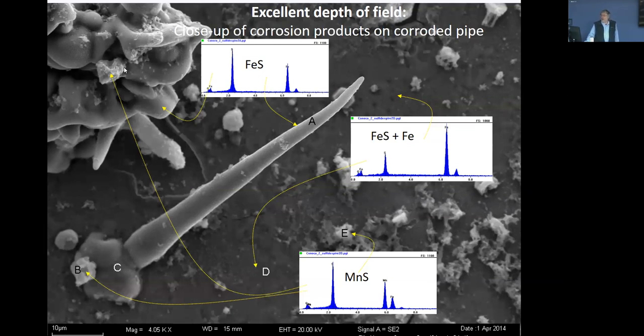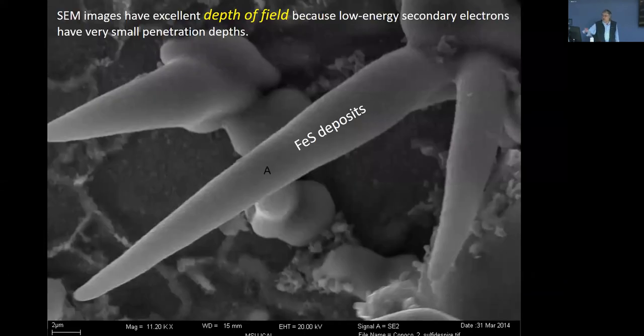You collect them, generate these images, and it's automatic. You don't have to, like an optical camera, worry about a small hole and things like that. Here's another example. This is way above the surface, several microns, and this is up here. The surface information is contained, and the electron beam doesn't change much of its focal properties within this distance, so you get this three-dimensional effect.